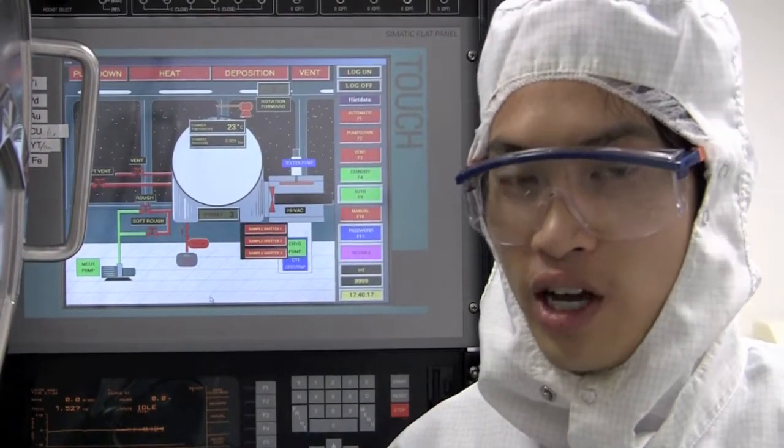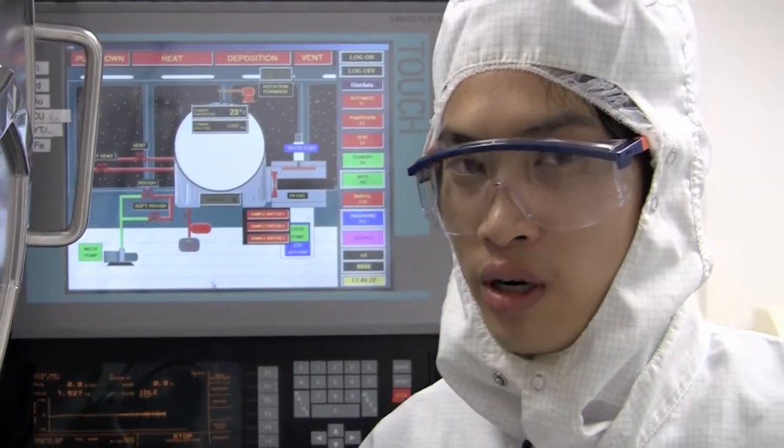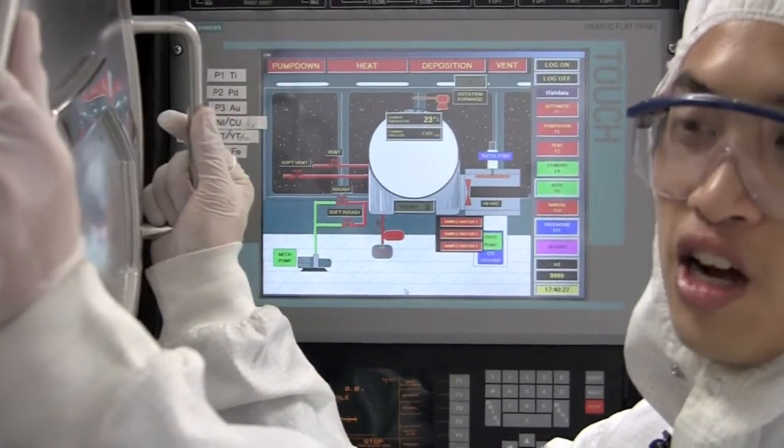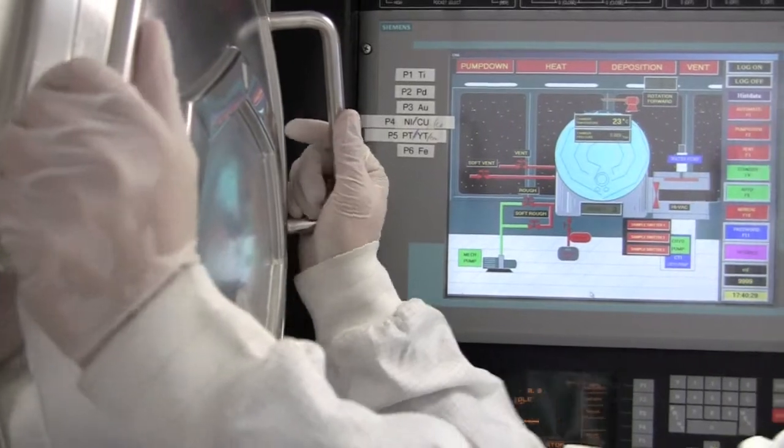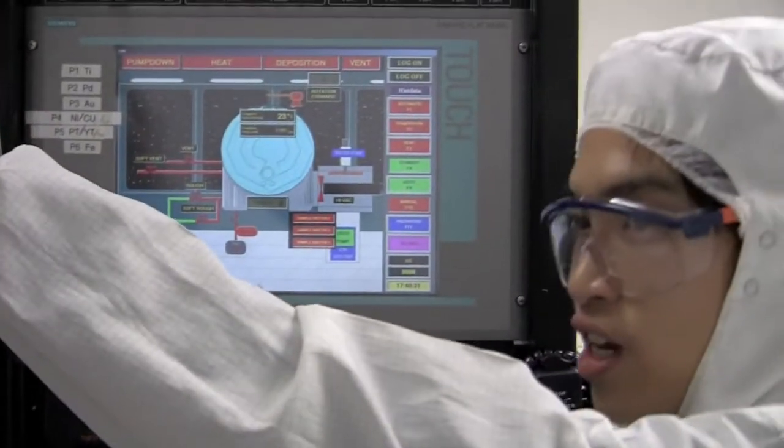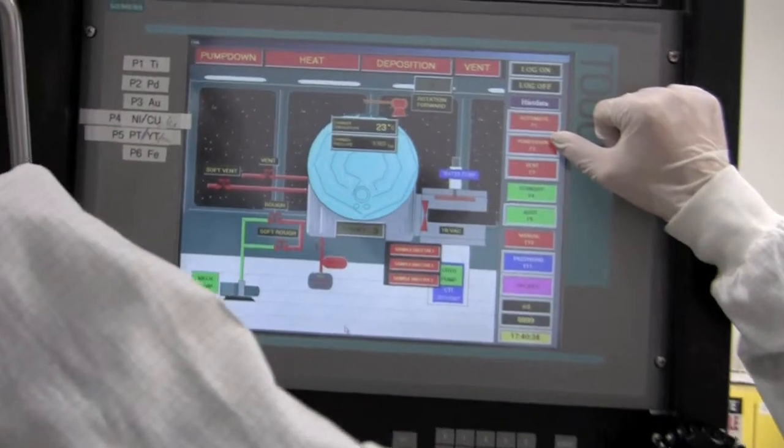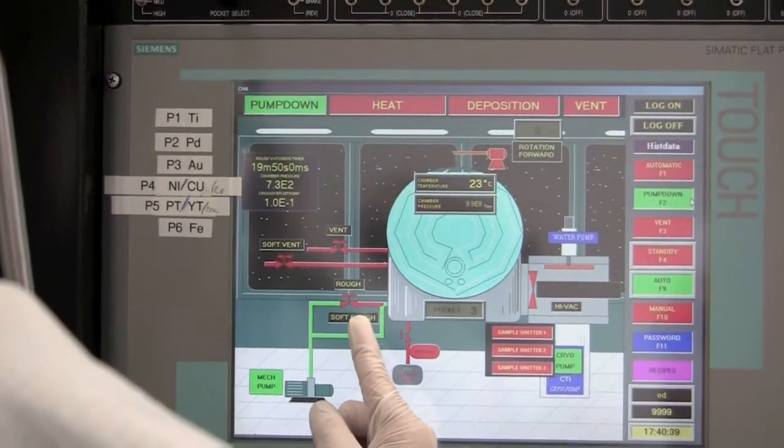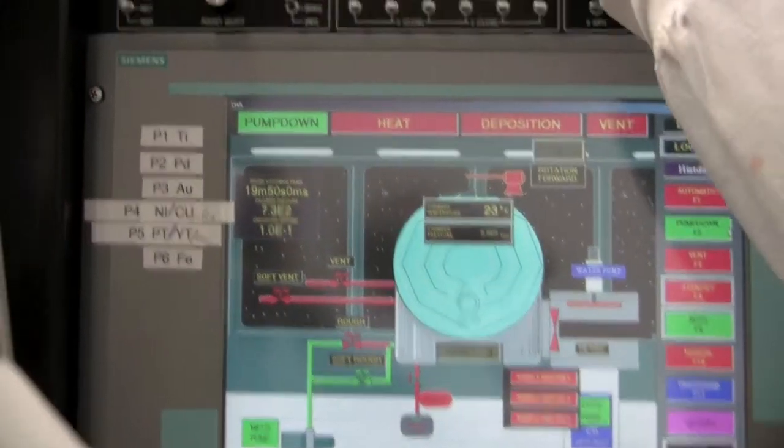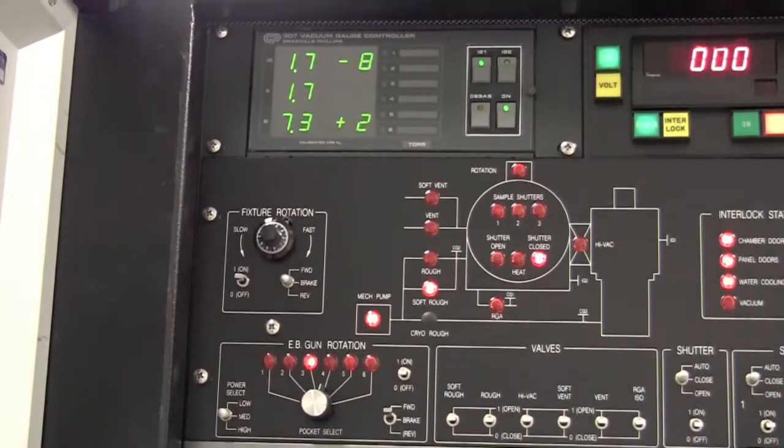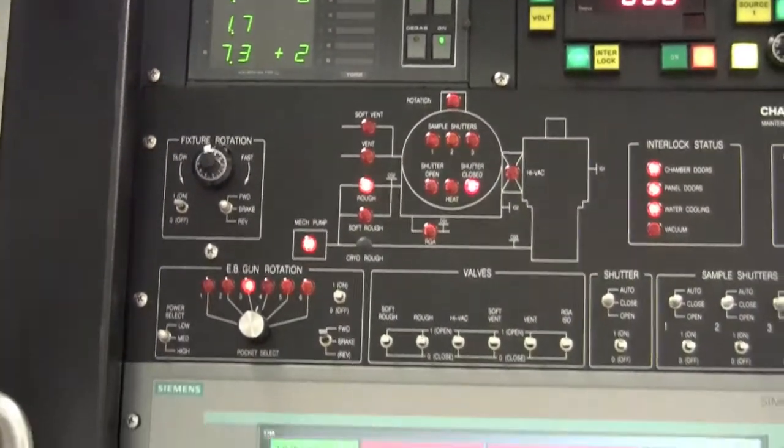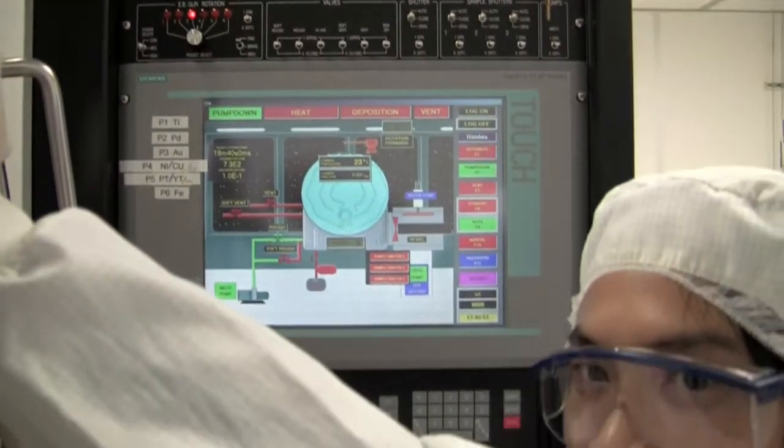Now that the wafers are loaded and the gold has been measured and put back into the evaporator, we're ready to pump down the chamber. To do so we're going to want to close the door and make sure that the seal is not compromised. We want to put one hand on the chamber door and then push pump down. Then we want to verify that the roughing pump gets turned on and that the pressure in the chamber starts to drop. If this fails you might have to try redoing it a couple times to make sure that the seal on the door is okay.